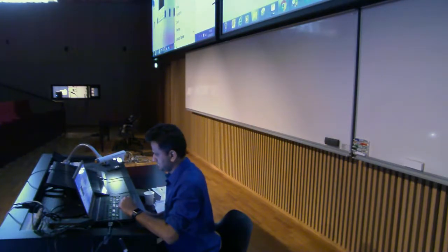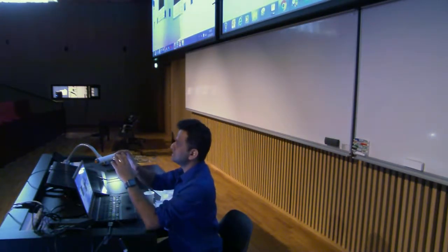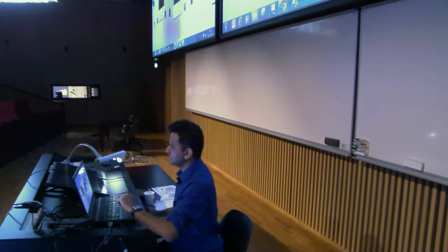Duplicate this. What else can you do in the stacks? You can go to Stacks, Montage, and Plot Z-axis Profile. This is also important because if you want to see the intensity of your region of interest or the overall image over time, then you can do this.